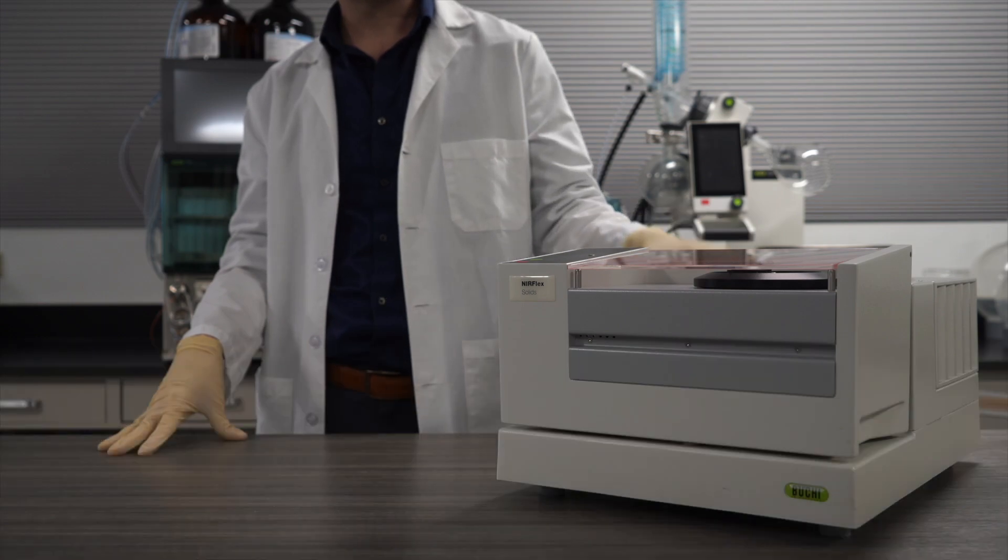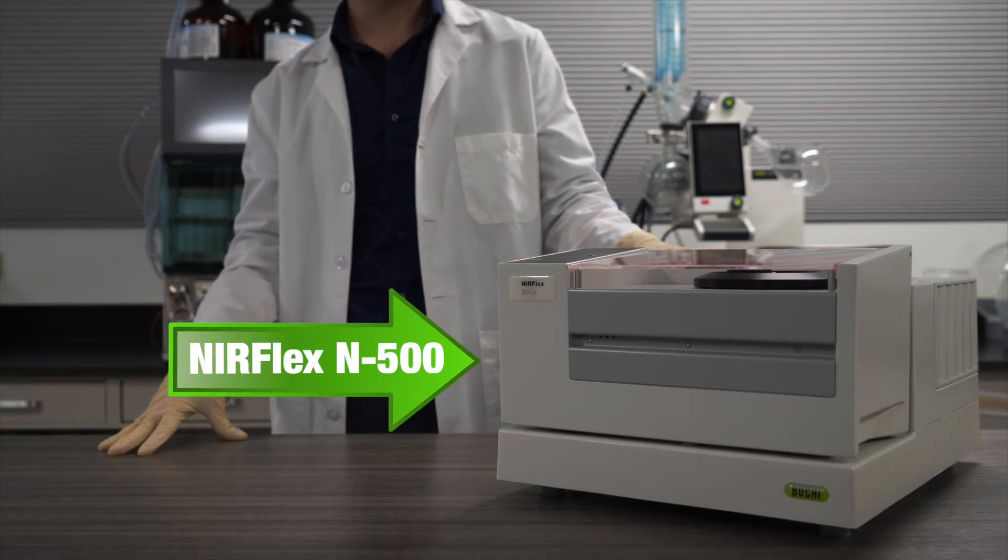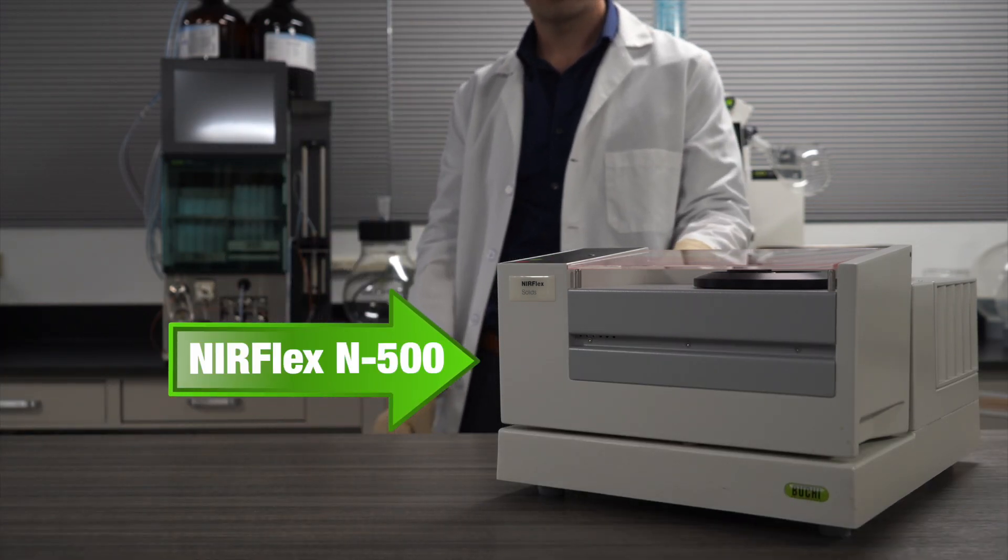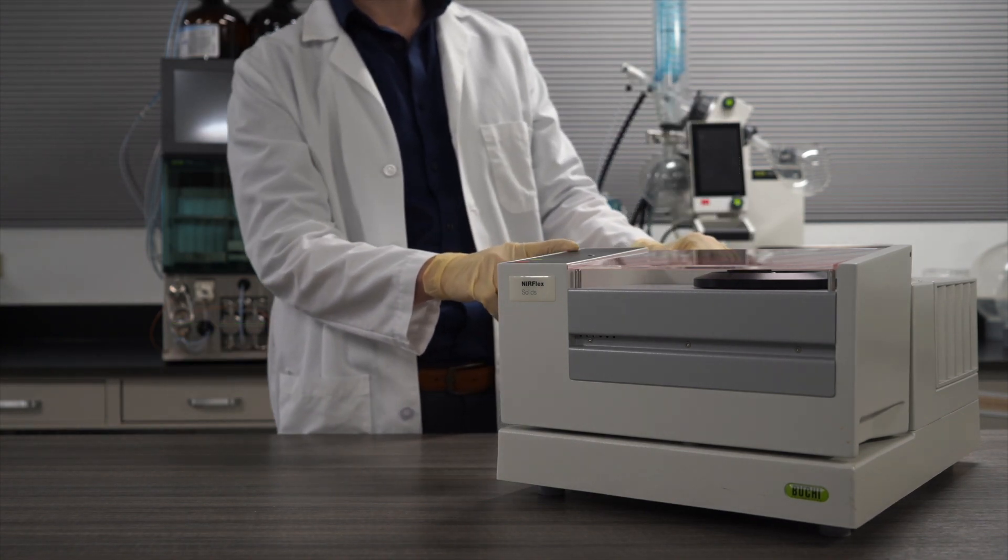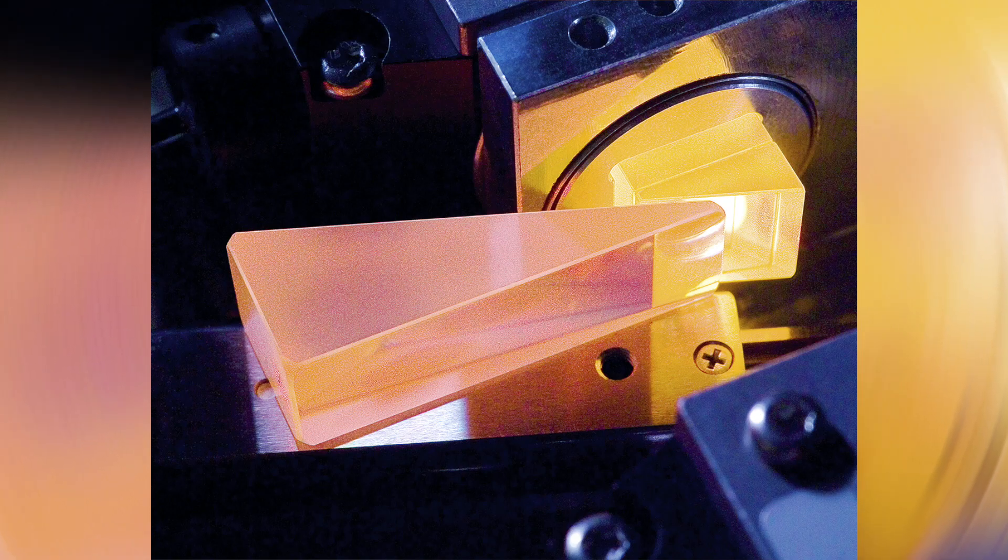Our NIRFLEX N500 system has been an essential tool for pharmaceutical QC labs for decades. The N500 system has a Fourier transform interferometer that generates high quality spectral data.